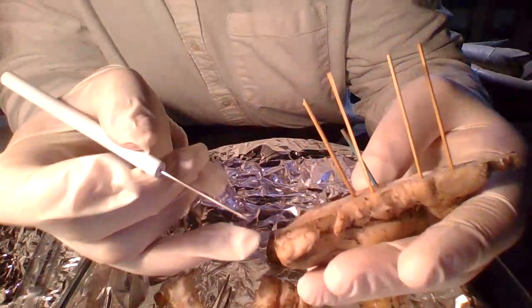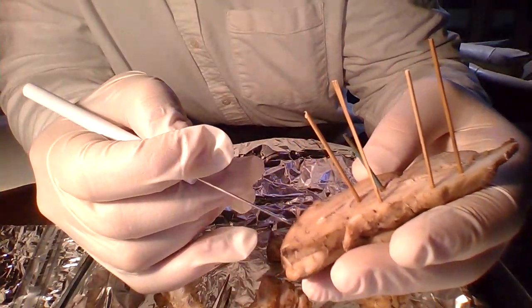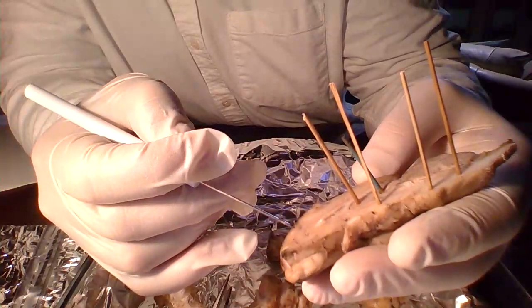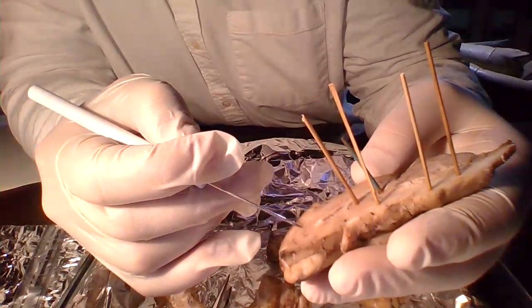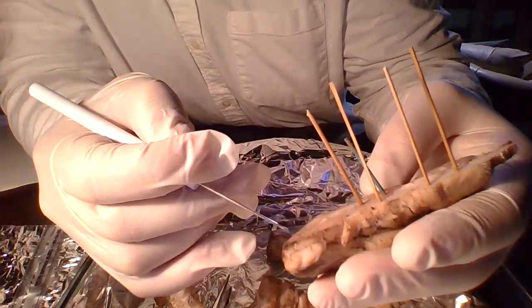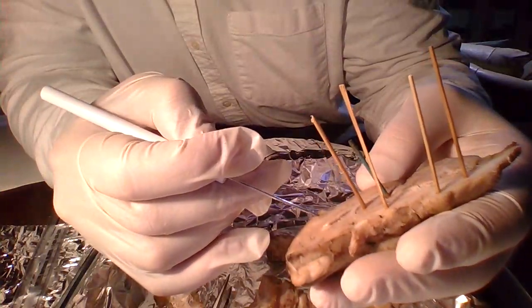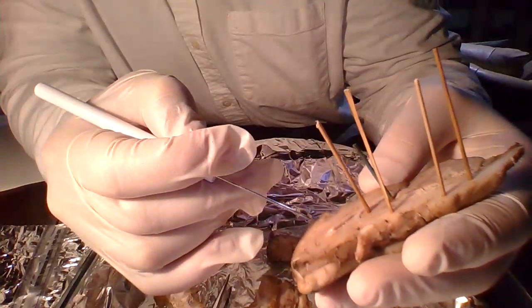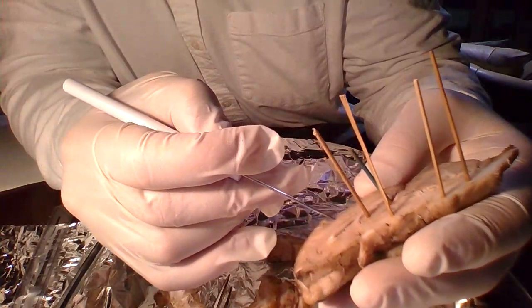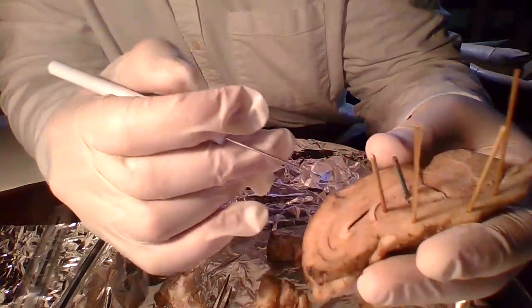Now, we do have white matter and gray matter. That's all there seems to be other than capillaries. There's also muscle. There's also connecting tissue, because we saw a lot of cartilage earlier, but that was just on the dura mater.